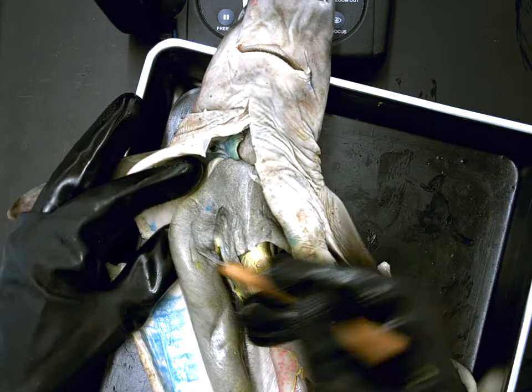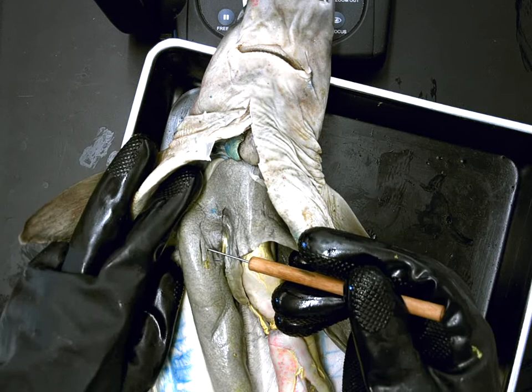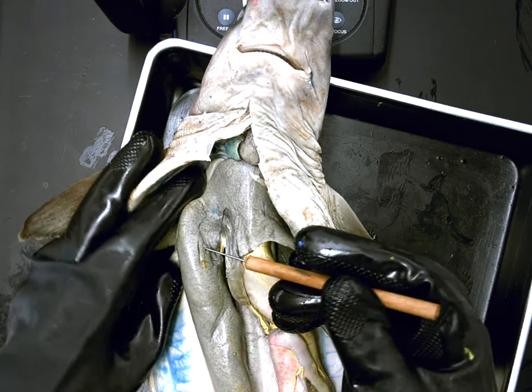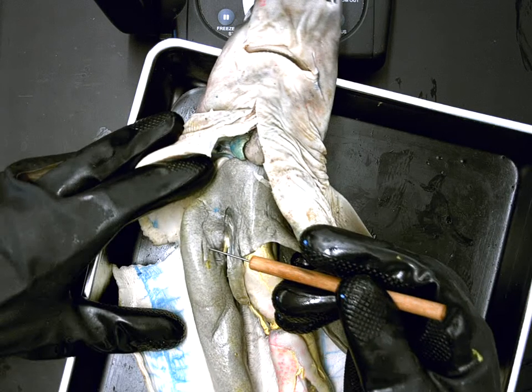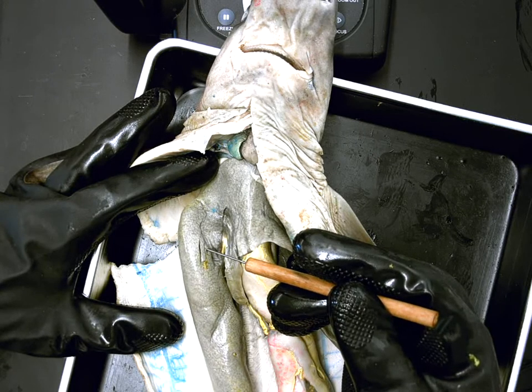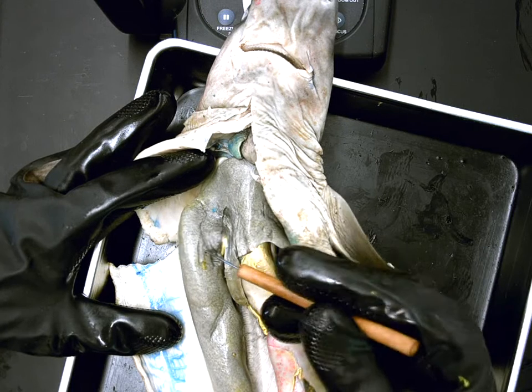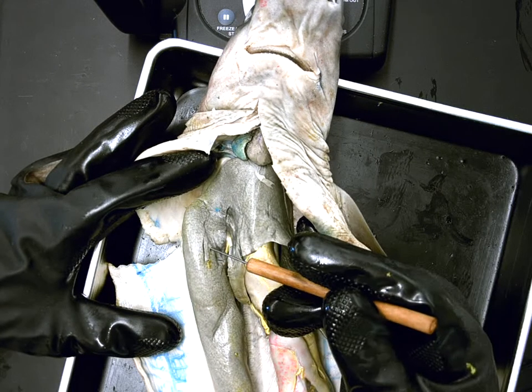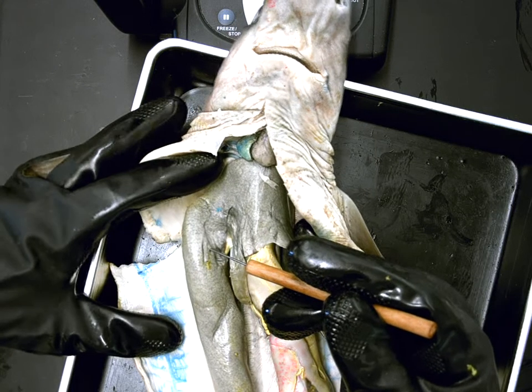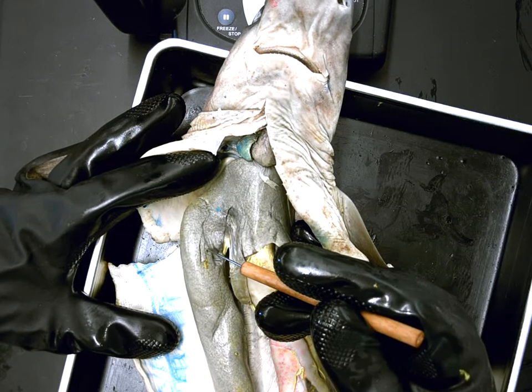Please tell me, Allison, what is the name of this structure? The liver. Give me one of its functions. Produces bile. Which purpose of bile is? For food breakdown. What kind of food breakdown? What does bile help digest? Nutrients. It's fats. Fats, that's right.